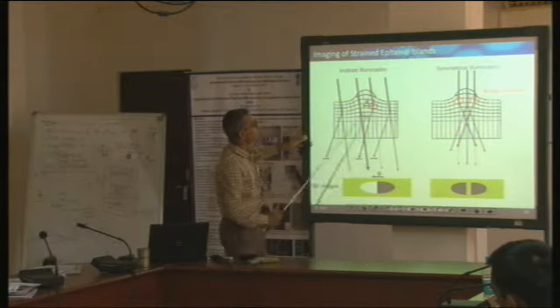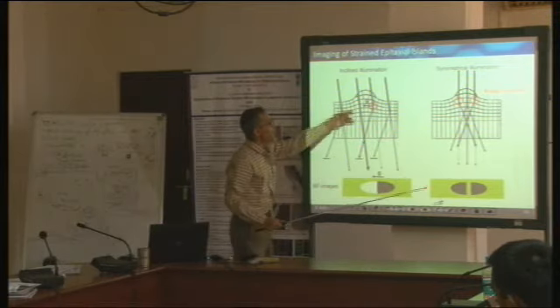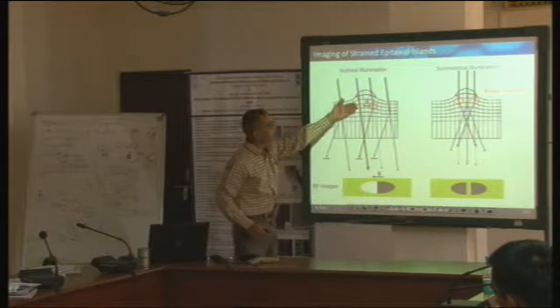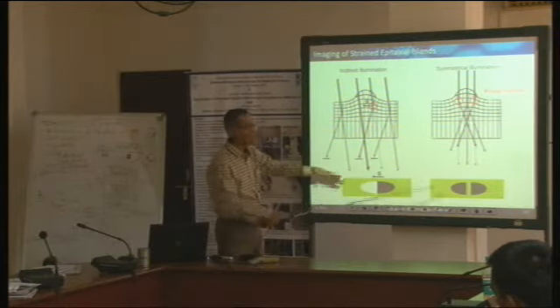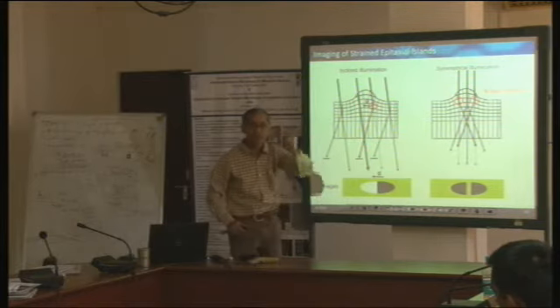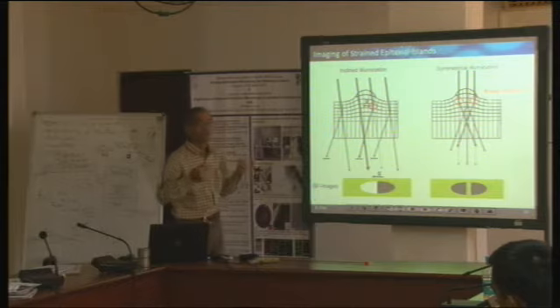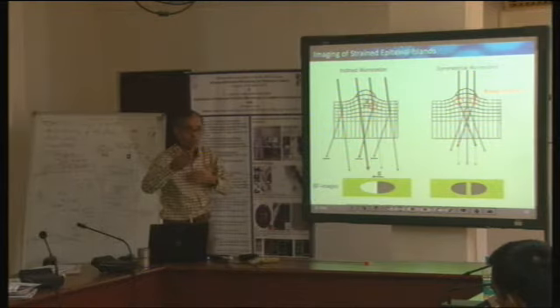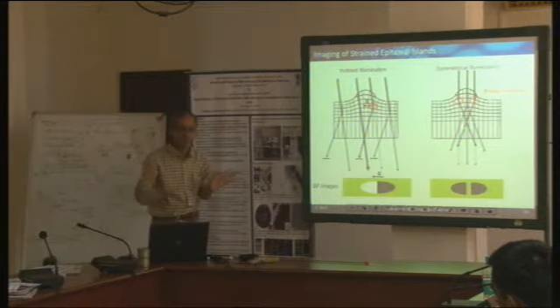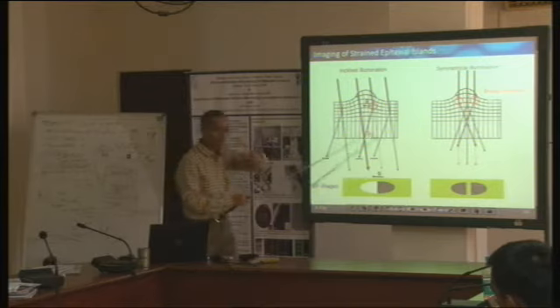The only difference between the two is here there is inclined illumination, here there is symmetrical illumination, and let's see how this precipitate, or its strain field, is going to look in the image. When I have inclined illumination, then all that we studied so far, all these diffraction contrasts, satisfying the Bragg diffraction, going away from the Bragg diffraction, all that knowledge you have to now apply here. So bend contours and so on.